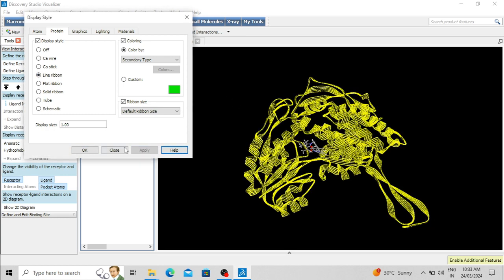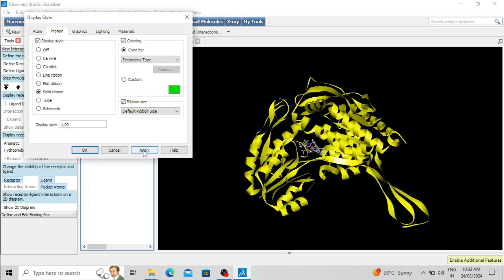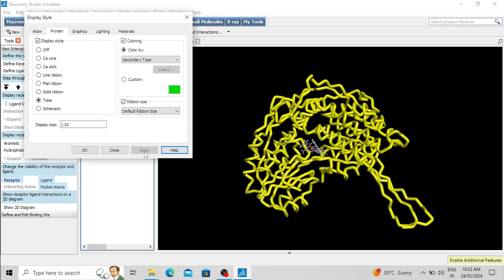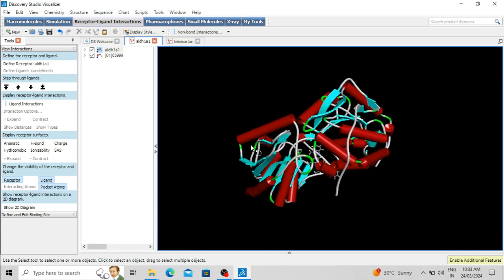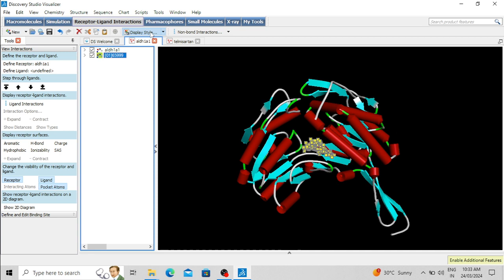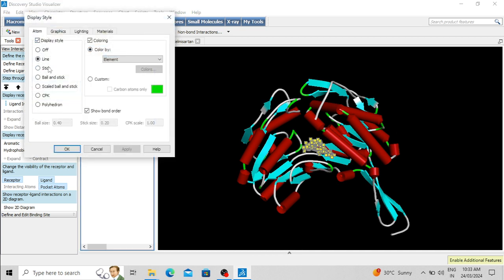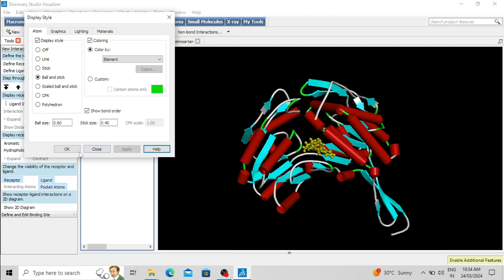The available protein display styles include line ribbon, flat ribbon, solid tube, tube, and schematic — click OK to select the display type. For the ligand molecule, first select the ligand, then in the atom options you can select different styles like stick. Apply it — the display style of the ligand molecule has been changed to stick, or ball and stick. You can also change the size of the ball and stick; for example, setting the ball size to 60 and stick to 40. CPK and polyhedron options are also available.